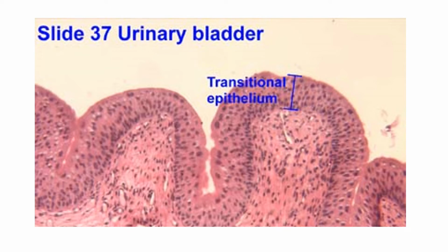Here again, another form of transitional epithelium. In this case, they've been squished down.